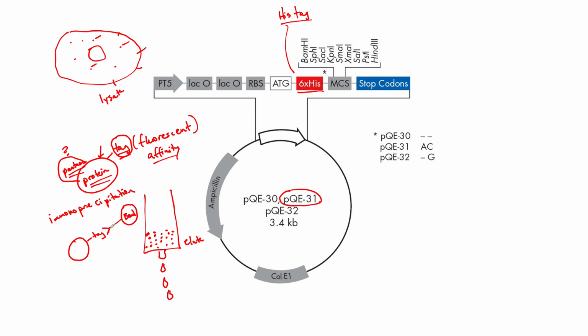Since this bead is attached to the antibody and the antibody attaches with high affinity to the affinity tag, when you put this in a centrifuge and spin it, this will pellet down to the bottom of the centrifuge, and whatever is attached to the antibody will also pellet down. So in this case, it would be this protein that you've cloned with its tag and any binding partner that it happens to be bound to. Then you can analyze this pellet with mass spectrometry or a Western blot or some other biochemical means to discover what binding partners are bound to that protein.